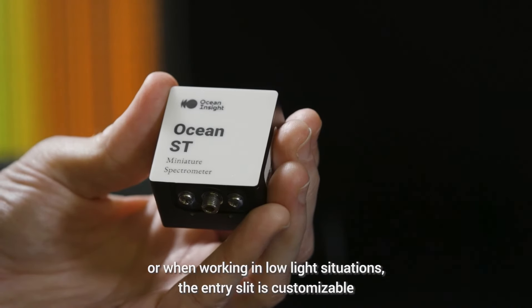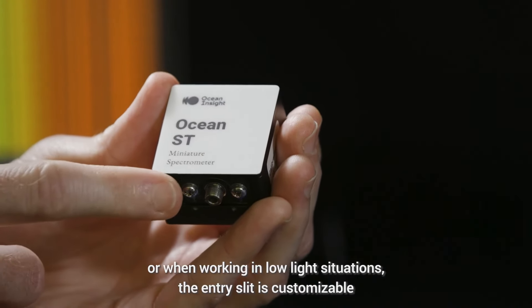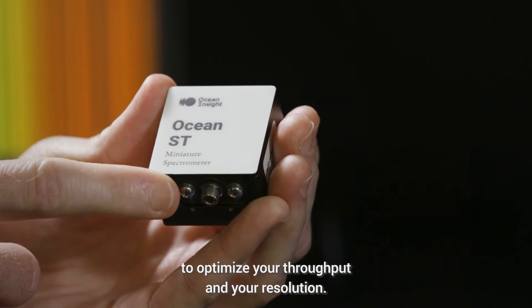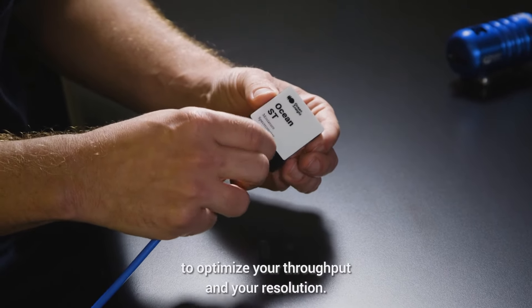For high-quality data or when working in low-light situations, the entry slit is customizable to optimize your throughput and your resolution.